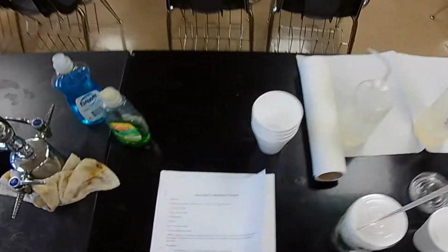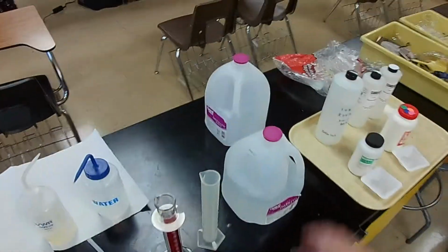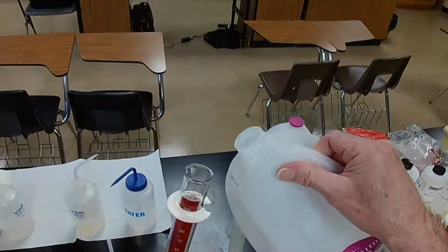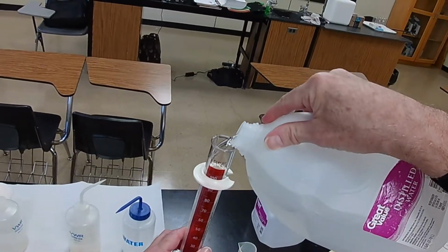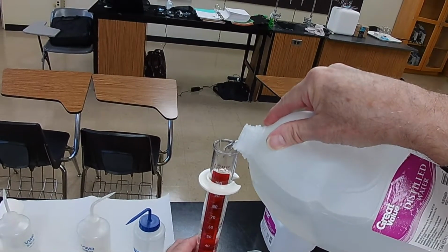And the method says we need 75 milliliters of room temperature distilled water. So we'll put 75 milliliters, and this needs to be very accurate, as close as you can get it.